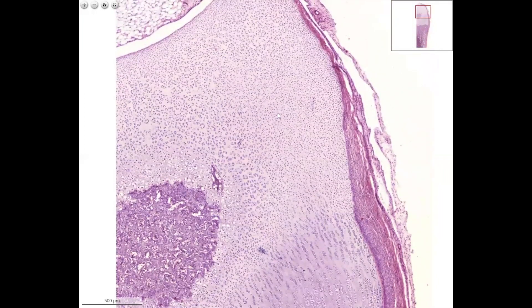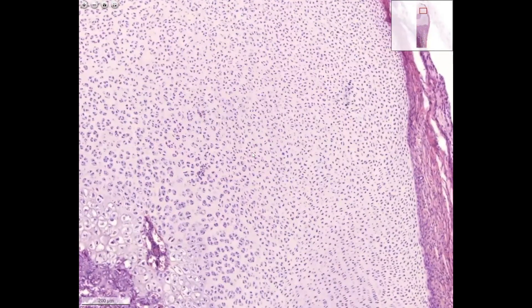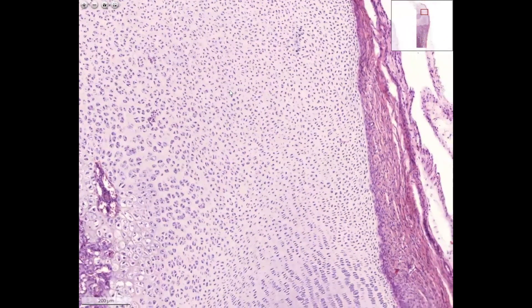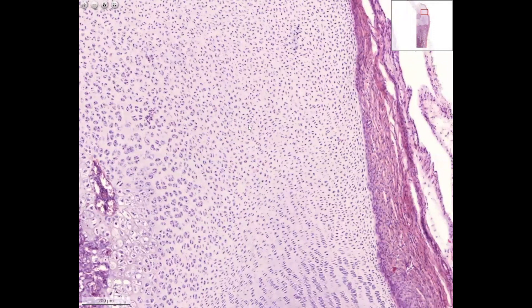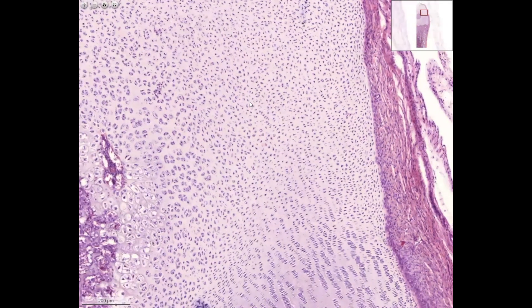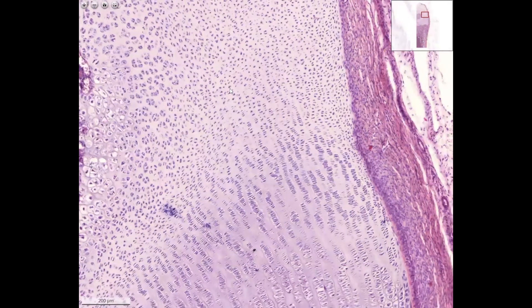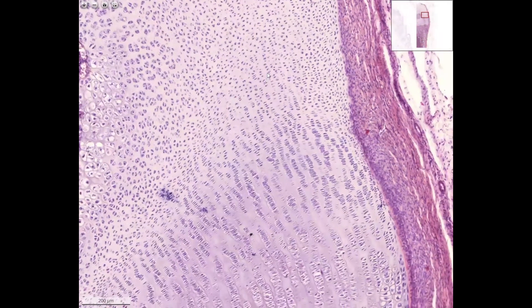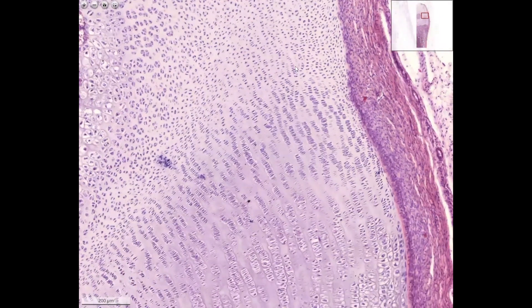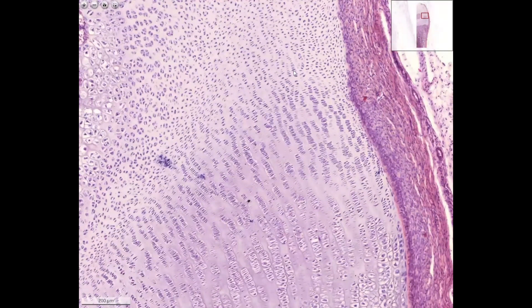If we go up to the cartilaginous territory, we have regions where we have resting cartilage — just normal cartilage cells scattered evenly in this region. As we get closer to the zone of mesenchymal invasion, the cells start to proliferate and they make longitudinal rows of isogenous groups. These rows are formed in the direction of bony growth. These isogenous groups get larger and larger, so this is the zone of hypertrophy.